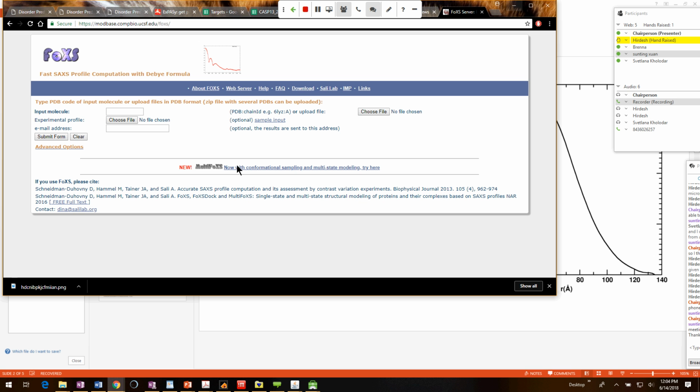So it might give you a little bit more accurate percentages of the mixture. Yeah, but go ahead. The problem is that what we see in the crystal might not exactly represent what is in the solution. Right. So we will probably have to do some molecular dynamics, and then it's probably best to have separate data for just a monomer and separate data for dimers.